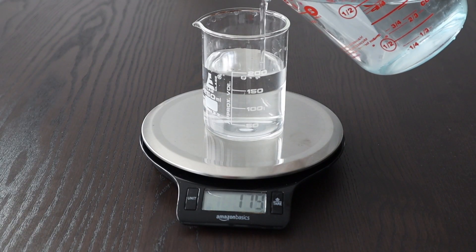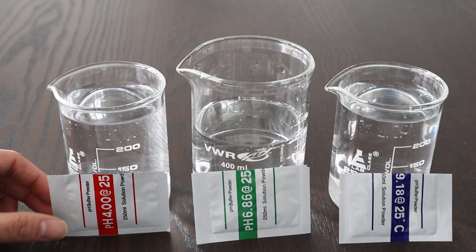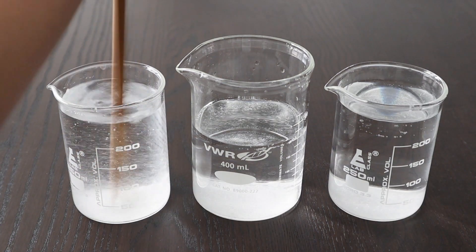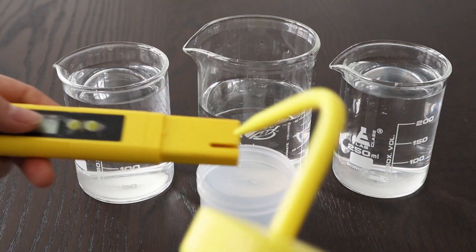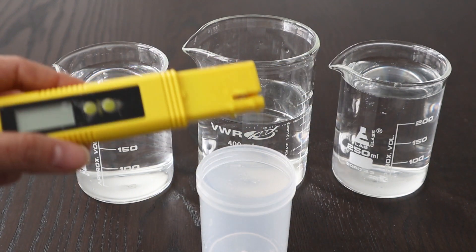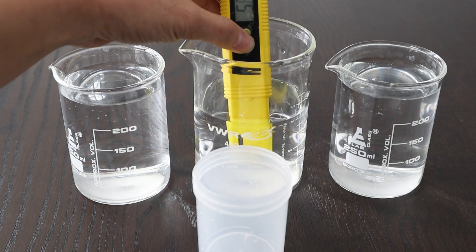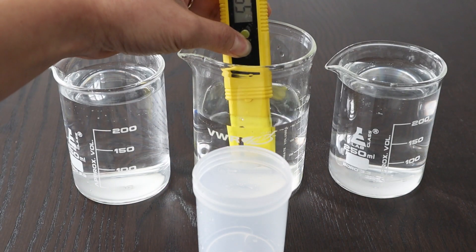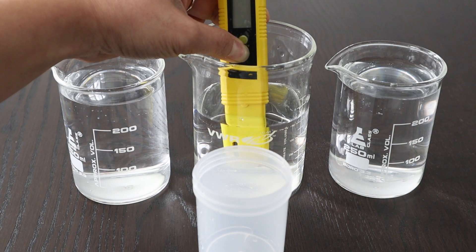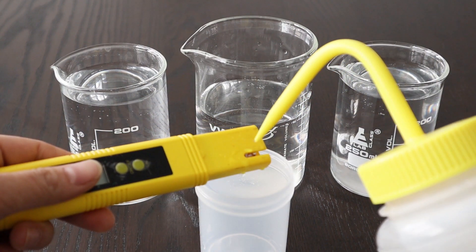To start off, I need 250 ml of distilled water, then I pour the calibration powders in and stir until dissolved. Then I take my pH meter, rinse the electrode, and put it in the 6.86 solution. I press the calibration button and hold it down for about three to five seconds until it blinks 6.86. After that, it should have calibrated to 6.86 and we should be ready to go. I'll rinse the electrode again with distilled water.